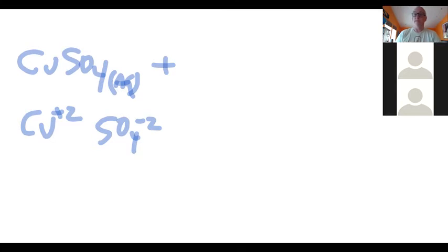Aluminum. Aluminum, right. And what state is the aluminum in? Solid. It's a solid, that's right. So what's the charge on the aluminum? No charge. There isn't, right, it's a metal. And metal, when it's just by itself, as a solid, doesn't have a charge. It's only when it reacts with a non-metal that it becomes positively charged. So these are our two reactants.